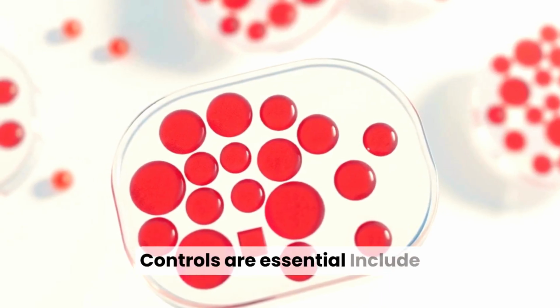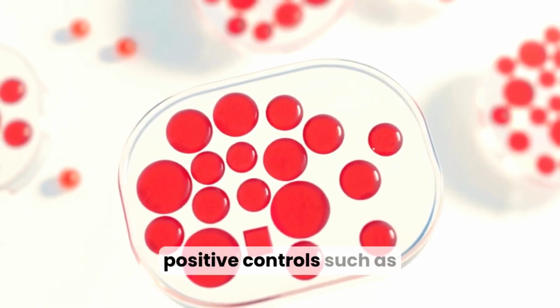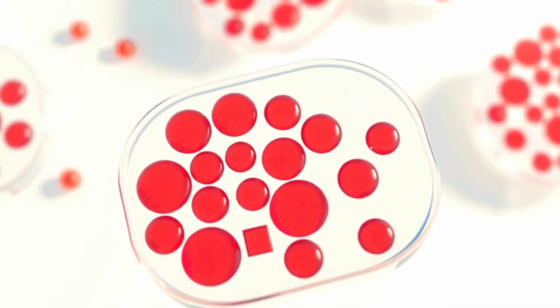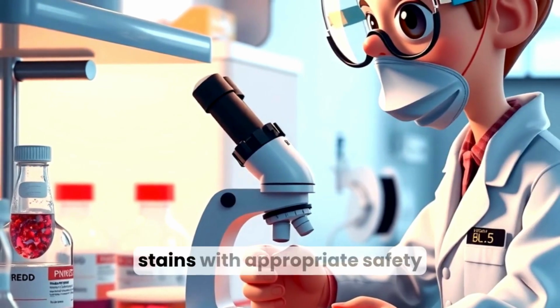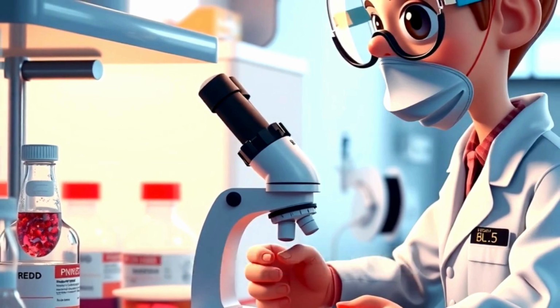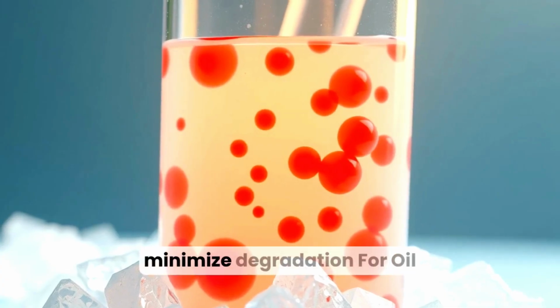Controls are essential. Include negative controls without lipid-containing samples and positive controls, such as liver or adipose tissue known to contain neutral fat. Always handle reagents and stains with appropriate safety measures, working in a ventilated area and following institutional chemical safety protocols. Collect tissue quickly to minimize degradation.